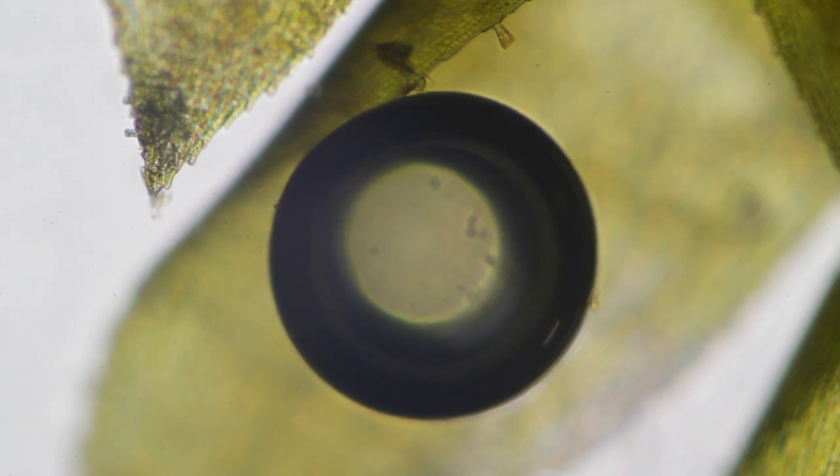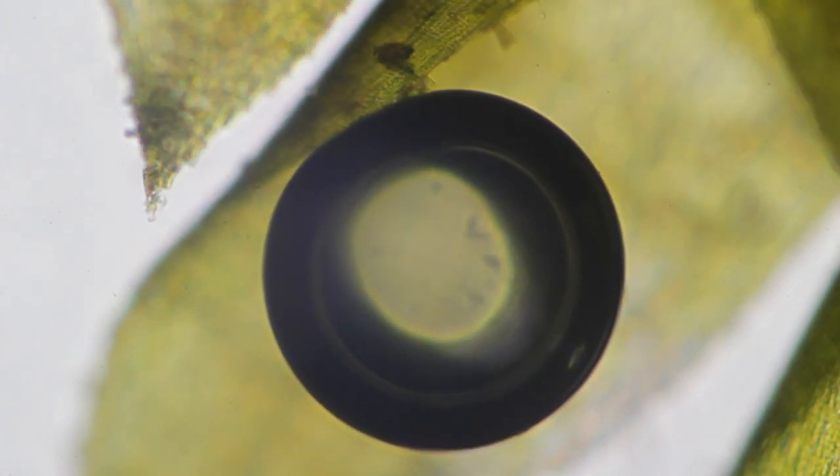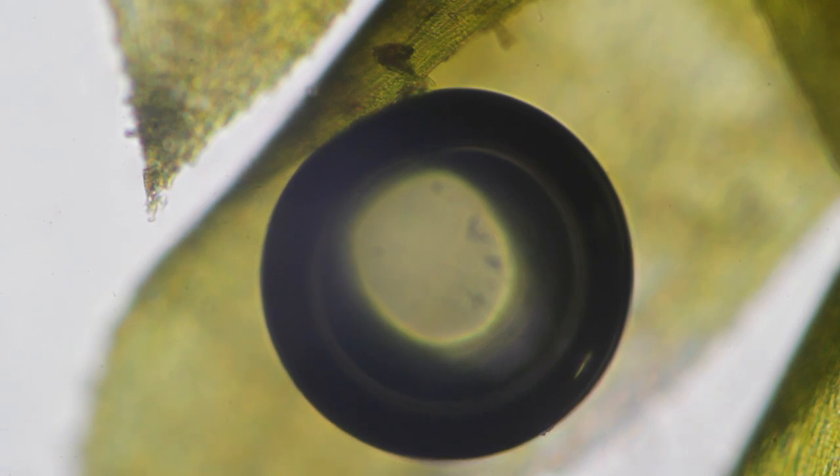This is now a growing air bubble — an oxygen bubble — at 60 times speed. The oxygen is formed by photosynthesis.